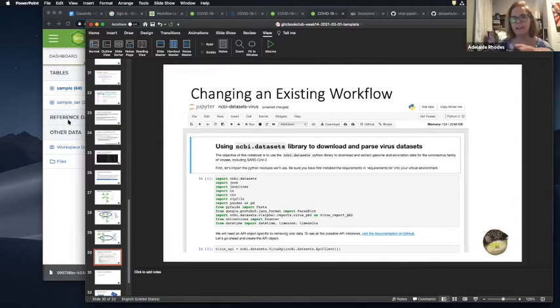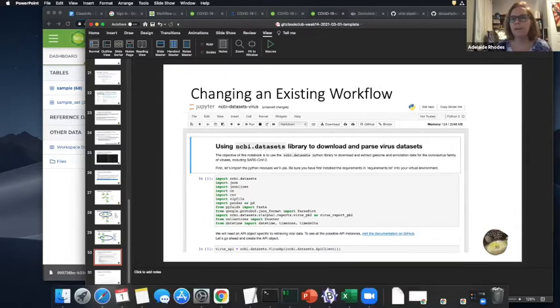I mean, we're never going to not need the regular pipelines, but we're trying to provide different launch points for different purposes, right? So clinicians maybe care more about the VCFs. They're not as necessarily interested in the raw data. Does that make sense? So that's kind of the concept that they're working on. Okay, so now I'm going to start jumping around through Terra.